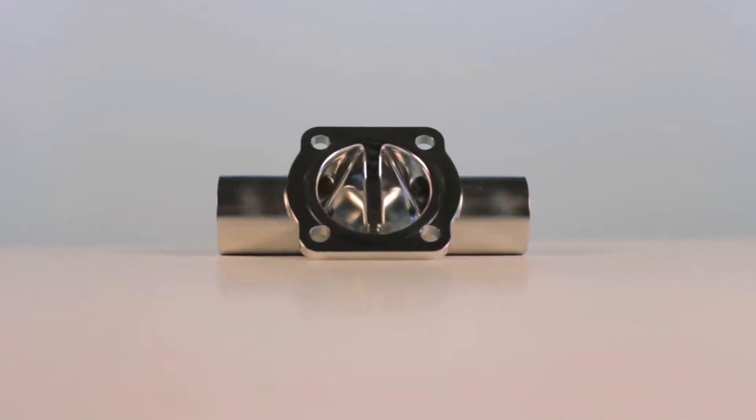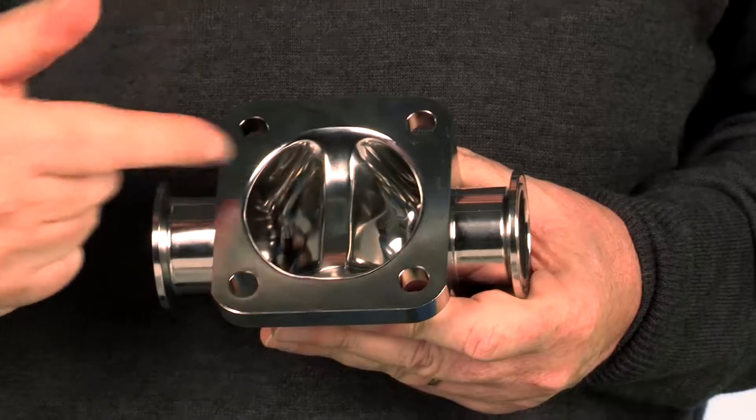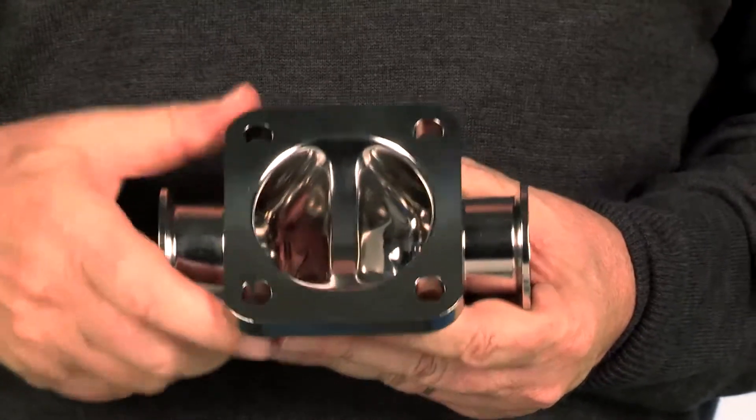I'd like to talk to you today about hygienic process valves as used in the pharmaceutical and biotechnology industries. Here we have the standard hygienic diaphragm valve. The design of these valves has not changed in the last 50 years.